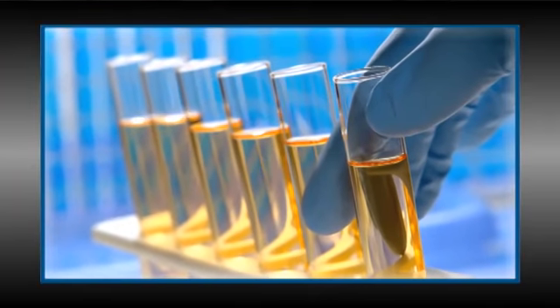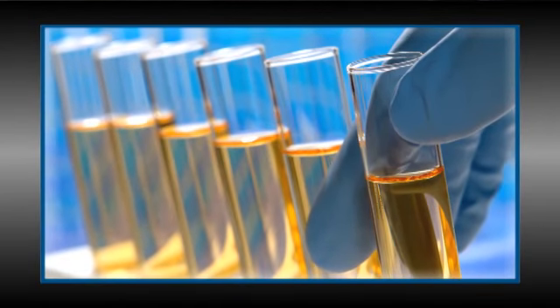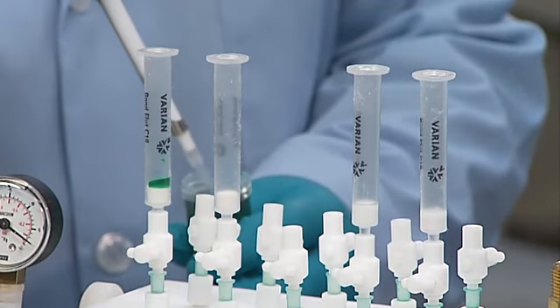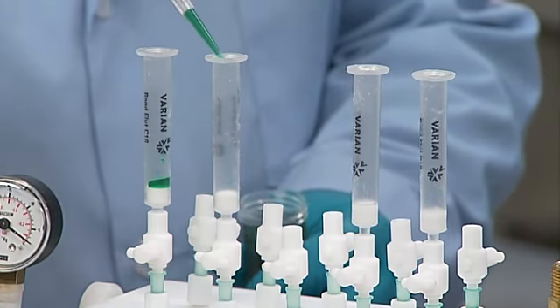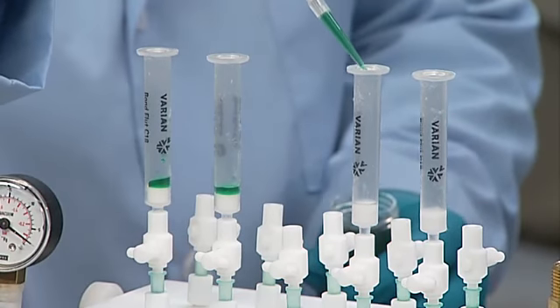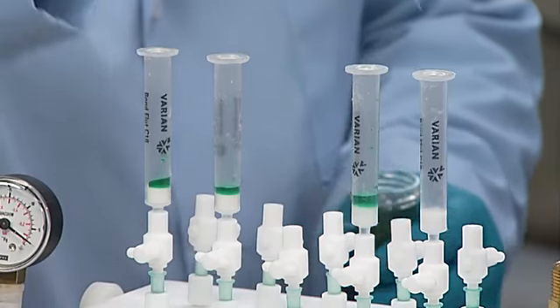It's common to pre-treat a sample prior to loading, as certain matrices will bind your analyte of interest. Additionally, treatment with acid will disrupt plasma protein binding. Dilution will minimize ionic and nonpolar interferences. pH adjustments, for instance in drinking water, will remove charged species.